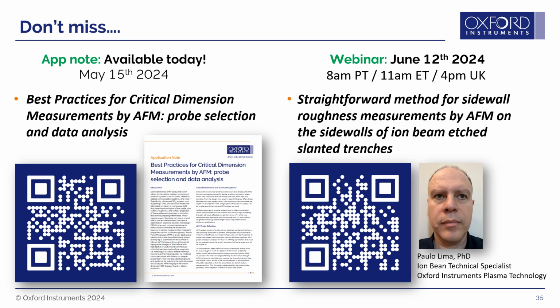In terms of what the limits of AFM roughness measurements are, it really depends on the base noise of the AFM. In the case of Jupiter, the base noise that we see is around maybe 30 picometers. So you can measure anything that is a little bit higher than the noise floor, if you have the right conditions and a quiet environment. So really, having a sharp tip and a quiet, low noise floor instrument allows you to measure very, very small roughnesses.